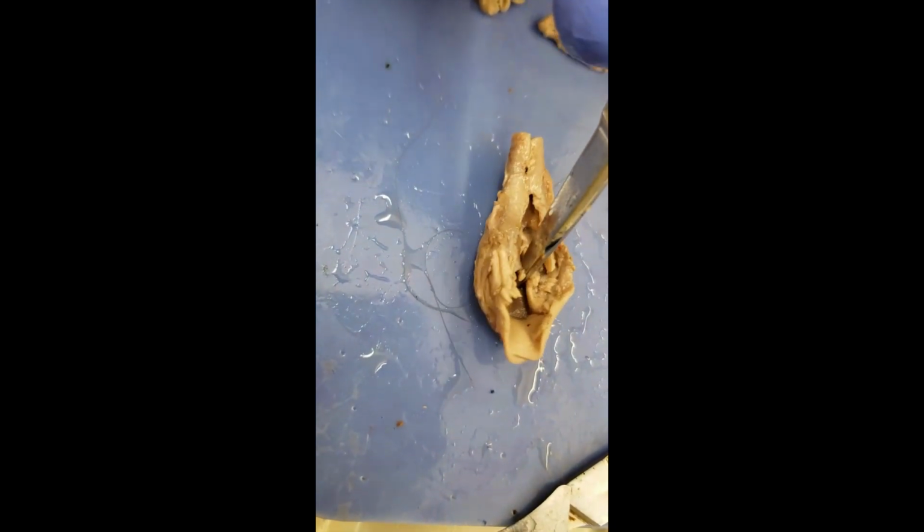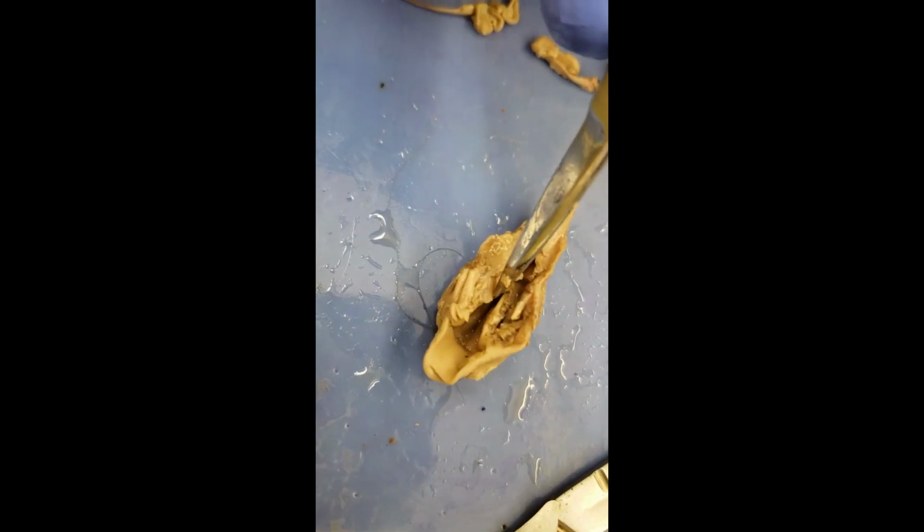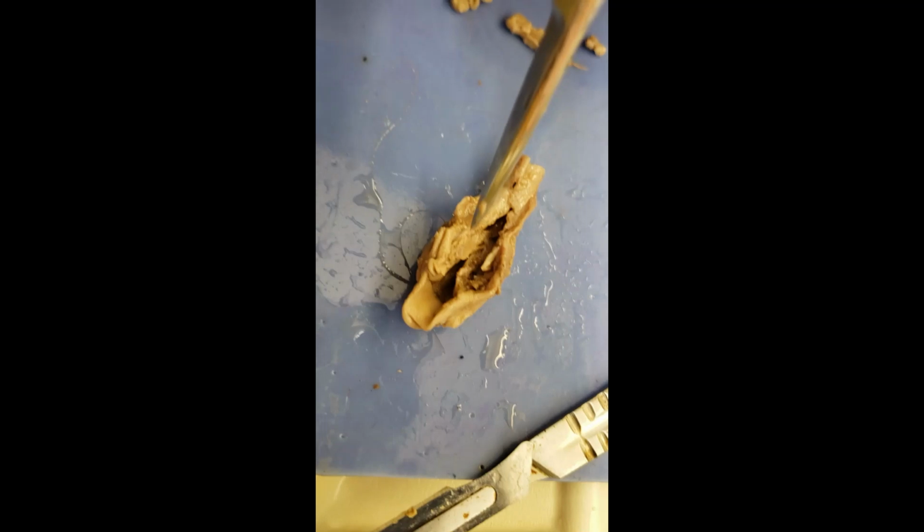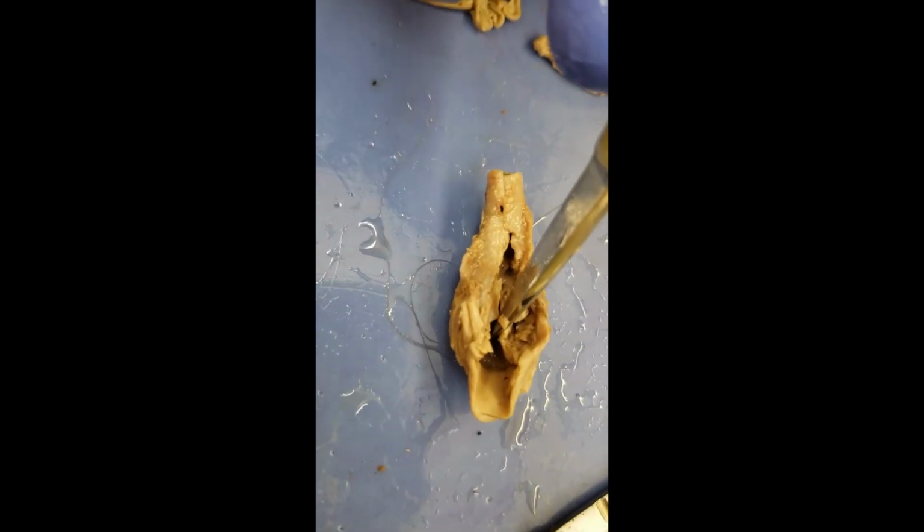Those flaps. Ignore the piece of hair. I don't know where that came from. It's not mine. My hair's short. I think it's somebody's hair. I don't know where that came from. It's slightly unnerving. But that's the vocal cord.